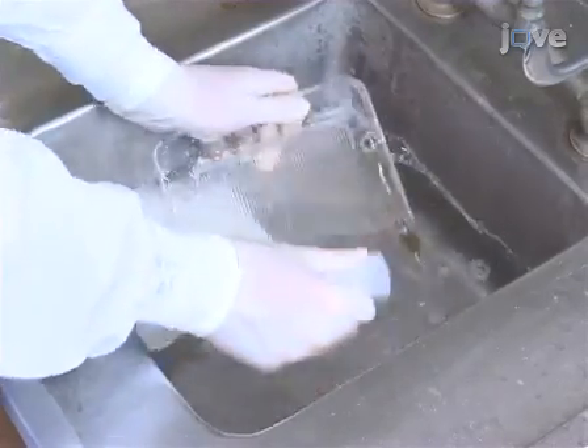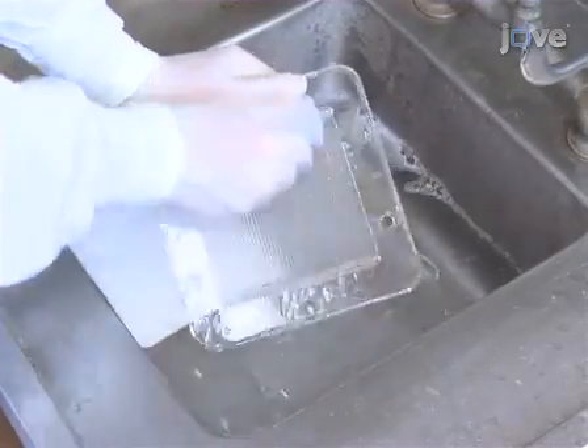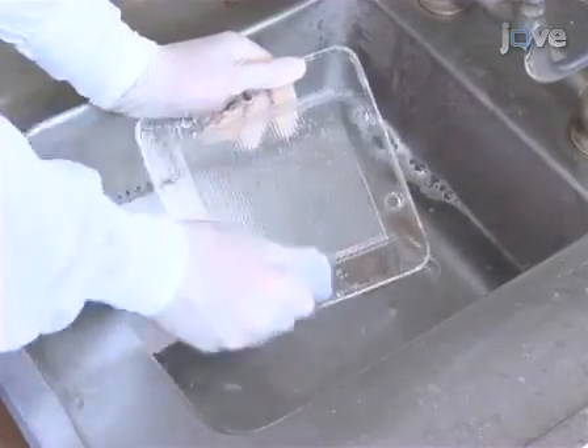Finally, wash the mini blotter with pyroneg detergent and a brush, rinse and allow it to dry.